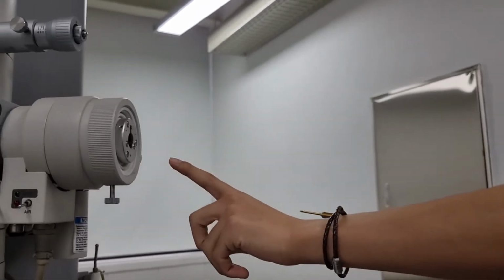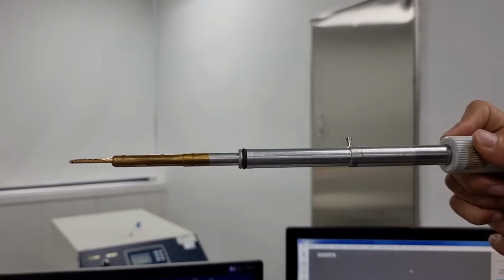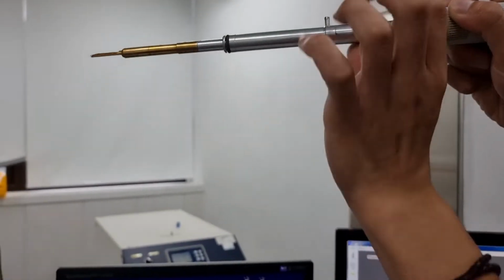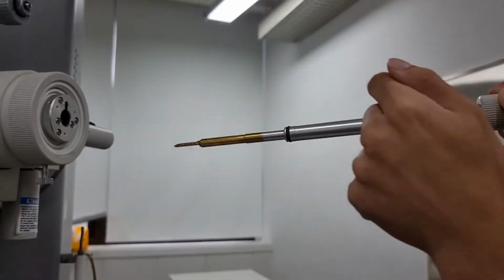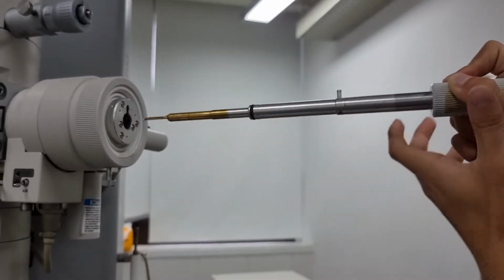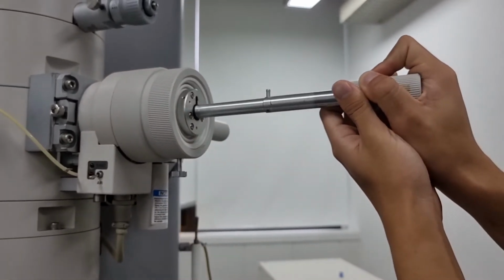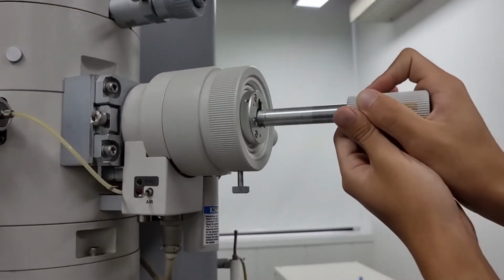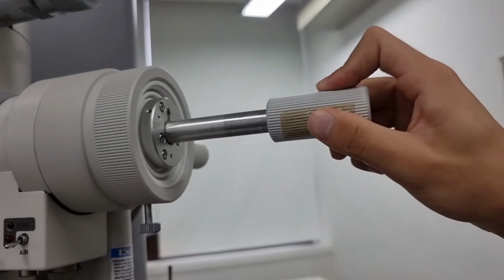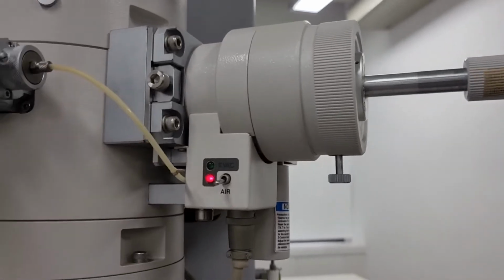You can see that there's sort of a keyhole if you look inside, and you can see this pointy thing that spikes out. You should match this hole to this, so that exactly the spikes get aligned, the points get aligned. So gently insert this so that it fits right inside. And listen carefully. Once you push it in, yeah, you can see that there's another clicking sound.